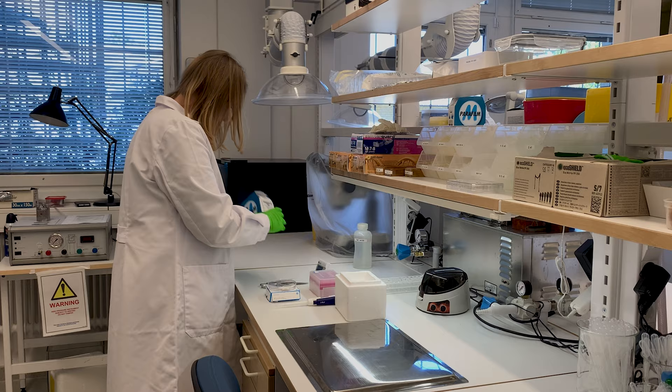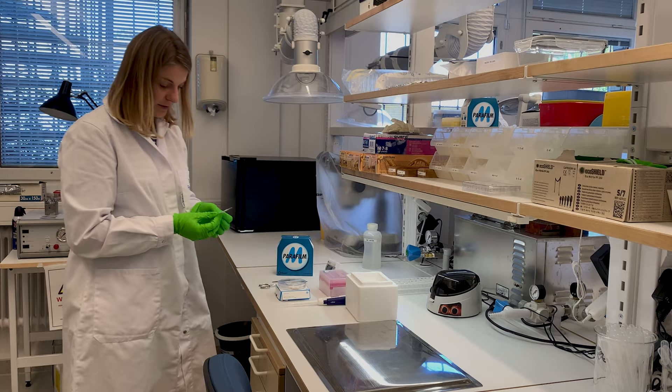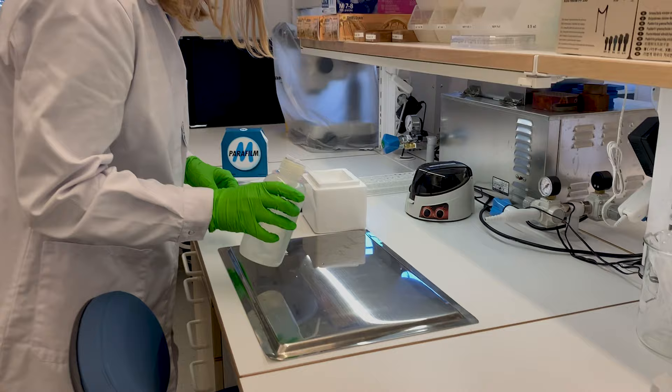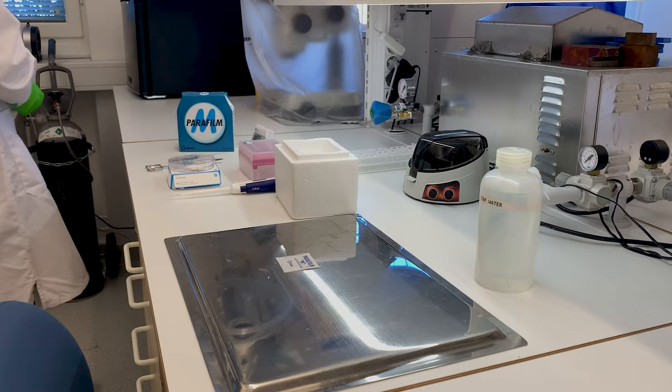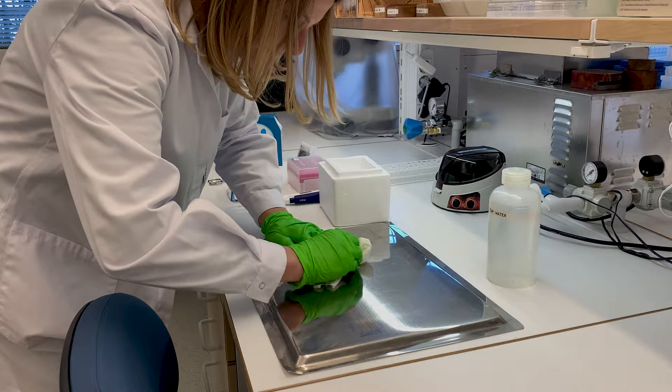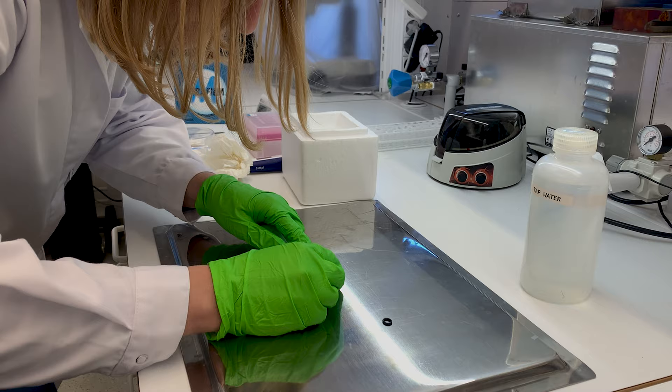We protect the metal tray with some parafilm. Depending on how many droplets you're going to have, you use a bigger or smaller piece. I just have one sample here and I'm going to do a very simple protocol, so a little square like this is enough. I can affix it to the support tray with some water — hot water is okay. With some filter paper we iron it out so that it sticks well. Then we can remove the paper.